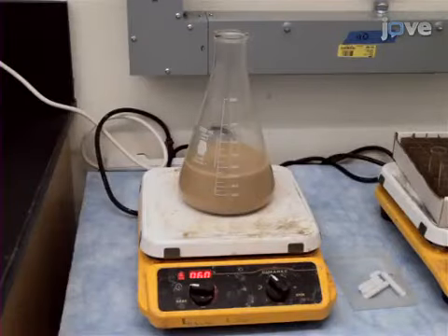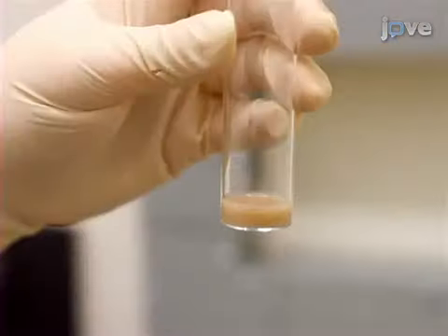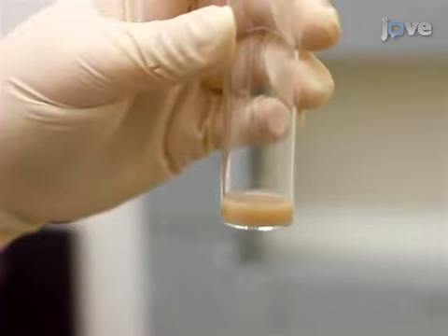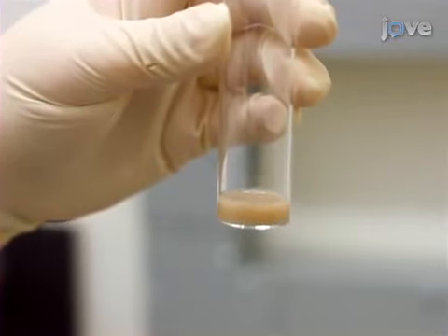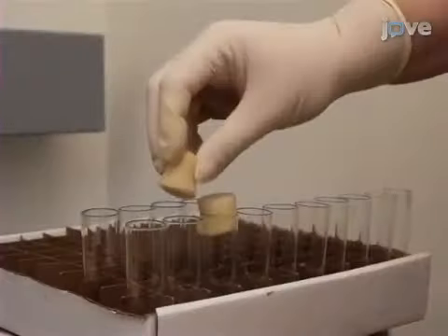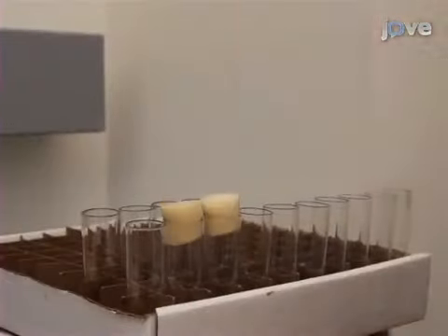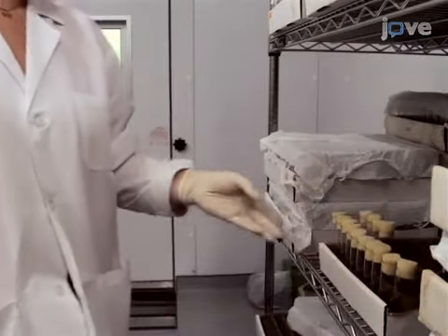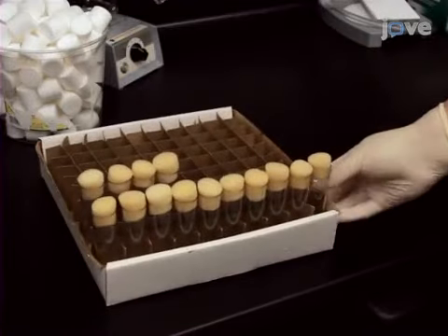To begin, prepare food according to the steps listed in the accompanying text protocol and let it cool down with constant mixing on a hot plate. Aliquot 5 ml of food into each narrow glass vial, making sure the amount of food is below the lowest ring of the population monitor. After the food cools down to room temperature, cover the vials with sponge plugs and keep them at 4 degrees Celsius for up to 2 weeks. Warm up the vials to room temperature before use.